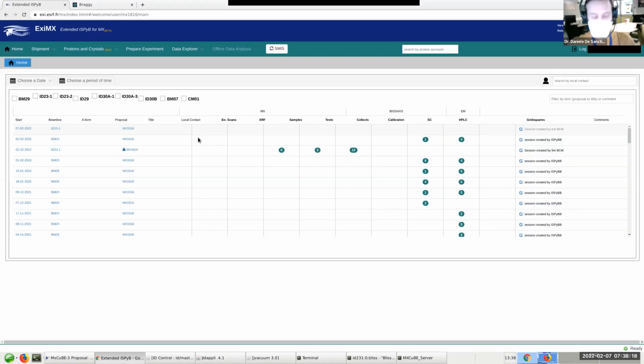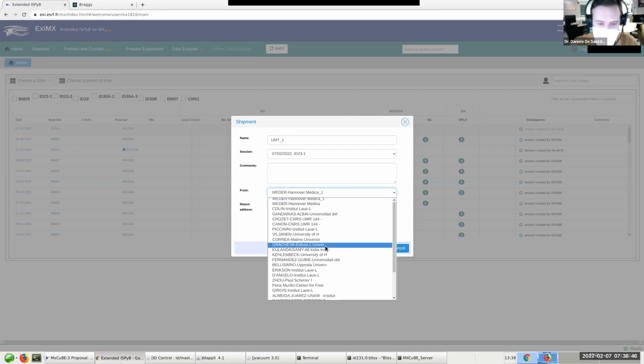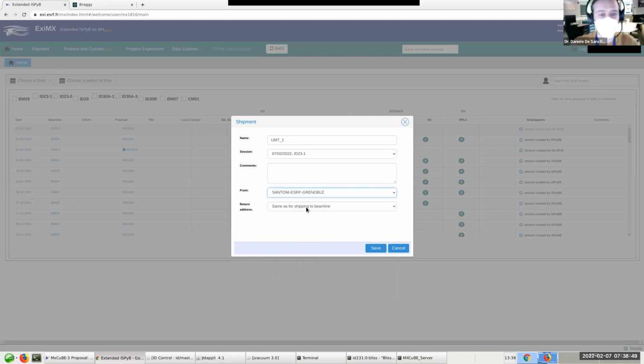But let's suppose this is already on your side. What we want to do now, we have fished our crystals and we want to send them to the ESRF. So I think you're familiar with this. We go to shipments, add new. We call this shipment user meeting tutorial_1, for the session of today. You will see here all the future sessions for your proposal, which are already synced with ISPyB. The return address is the same as the shipment.